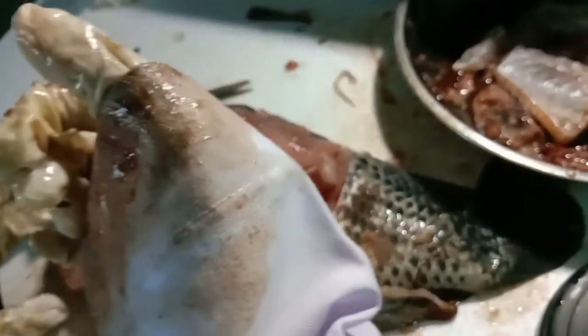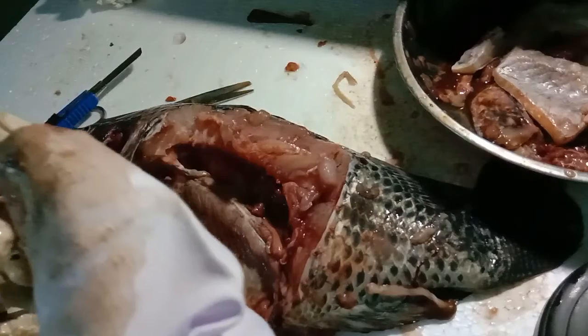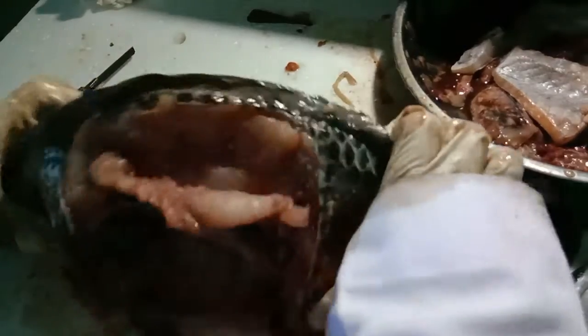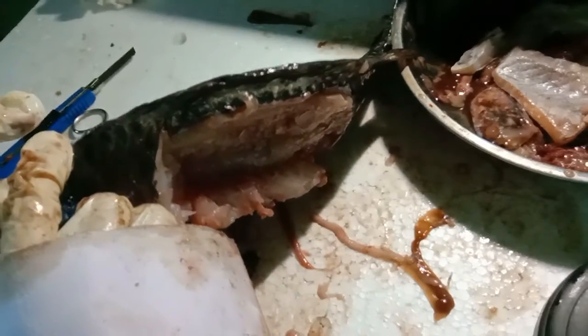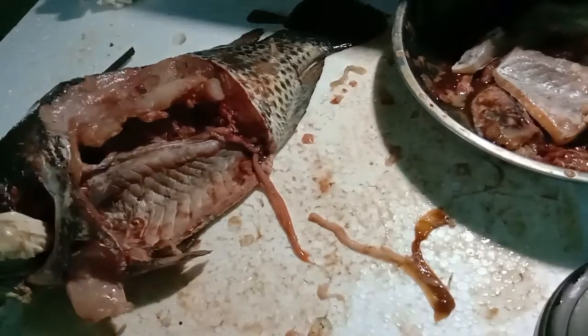Next discussion is about the nervous system. The main nervous system of fish is the brain. First, we need to cut the upper head of the fish. It's here. So you can see the brain and the nerves that attach to the brain clearly.